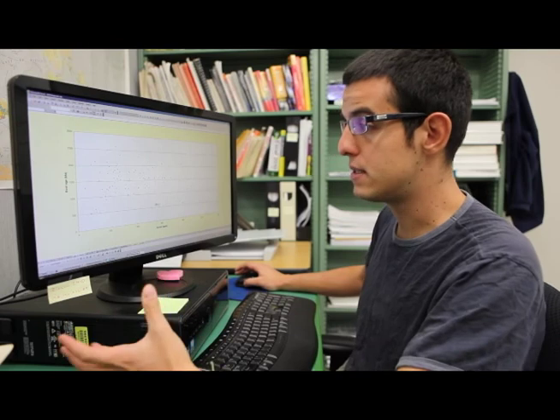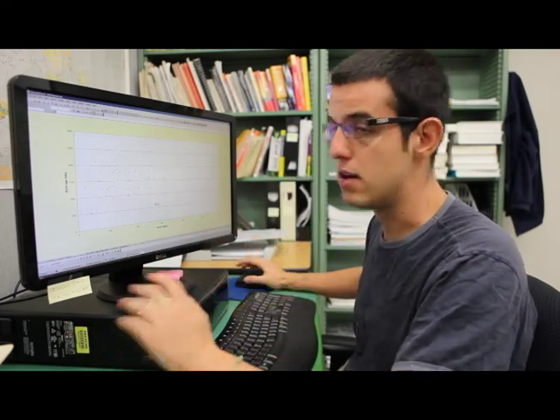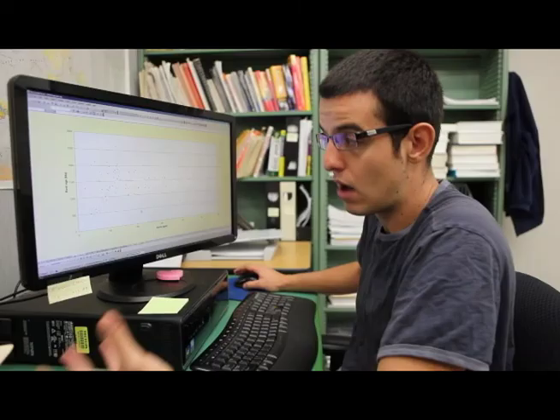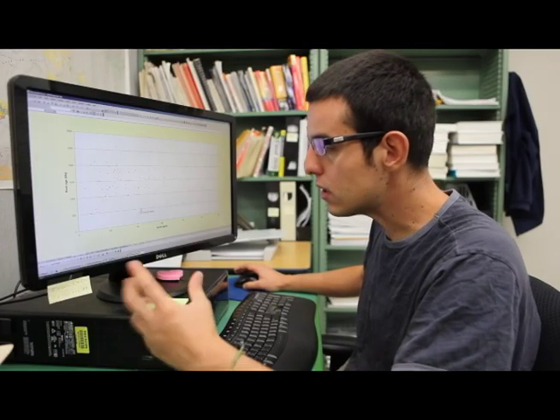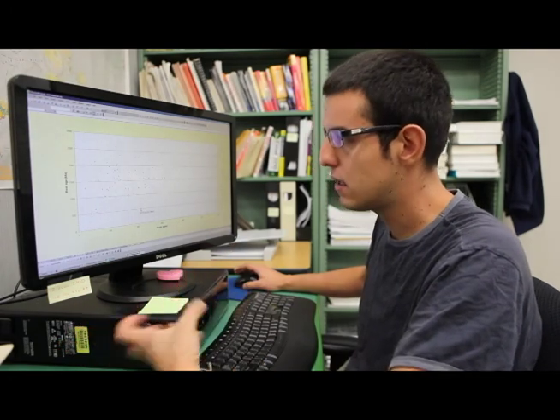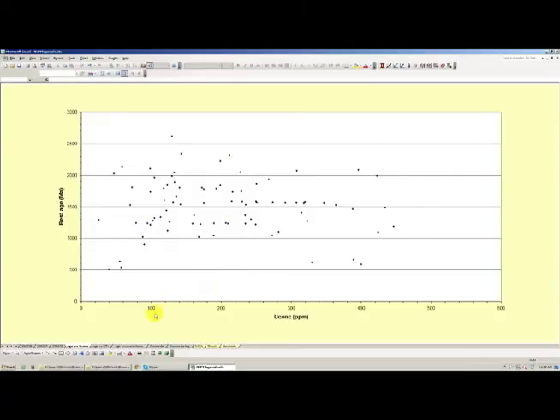What that means is that some of these grains might have accumulated enough radiation damage that the age is being affected by lead loss in the high uranium concentration grains. If that was the case, you want to put more weight into the low uranium concentration grains that are less metamictized and therefore more retentive of radiogenic lead.